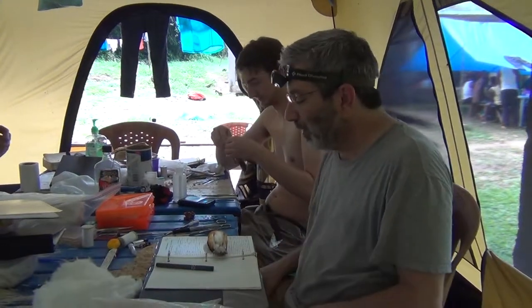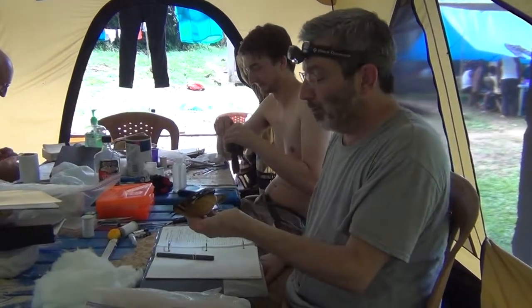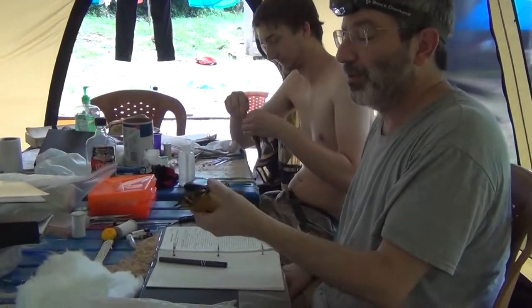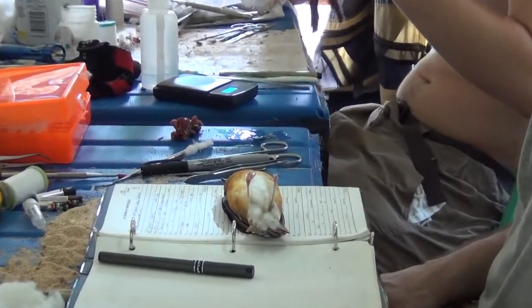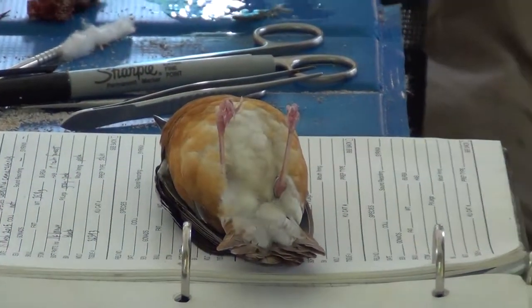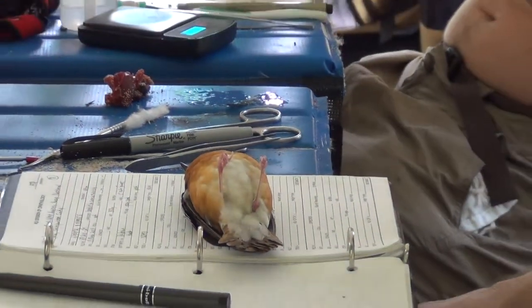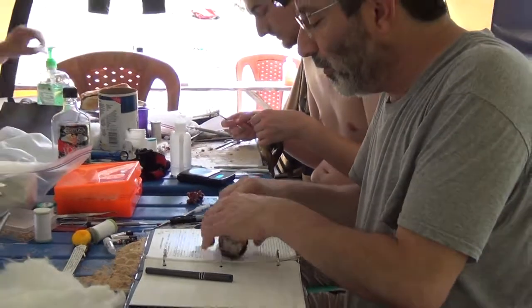We're going to run through the skinning process. This is a Geocicla cameronensis, which is a pretty poorly known bird, and we're getting some of the first documentation in detail of its breeding season by looking at the gonadal condition of a bunch of individuals.